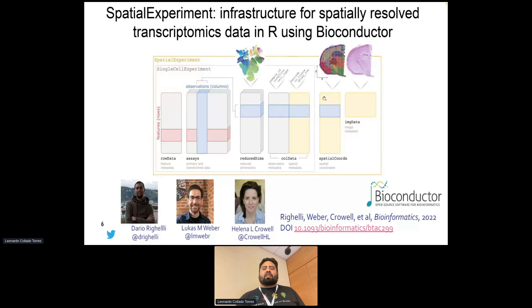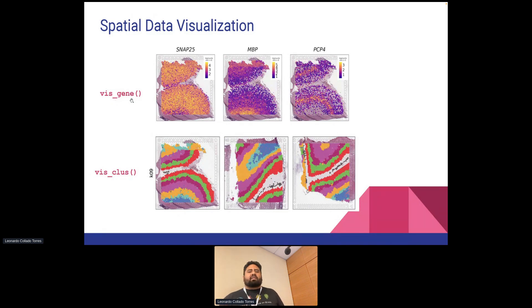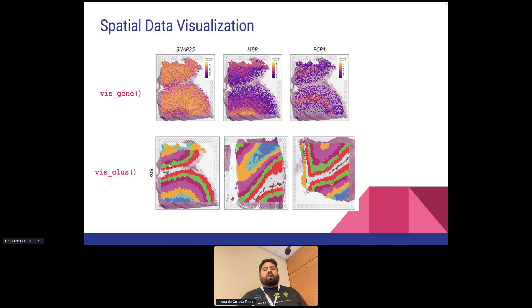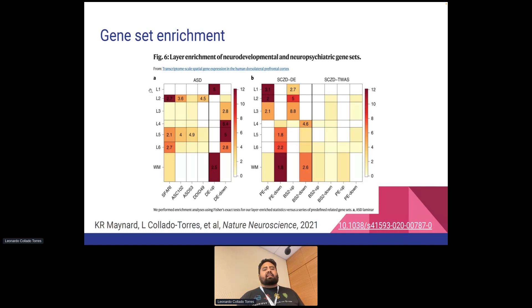In spatialLIBD, visualization functions all start with the prefix 'vis'. We have vis_gene, which is where we plot continuous variables, and vis_clus, which is where we plot discrete variables like clusters. Both functions have very similar parameters, and we'll show you some of them next.